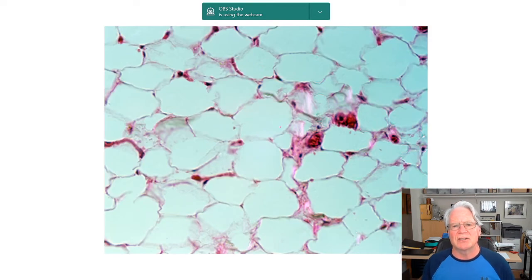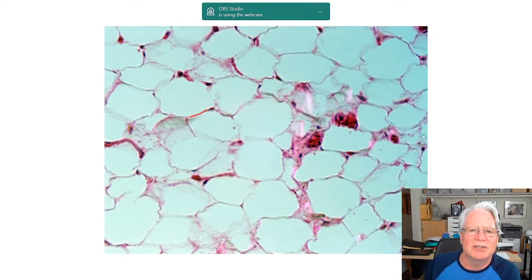Let's take a look at this again a little bit closer now. Same thing, we get these kind of flat surfaces here. This is a little bit irregular, but still fairly flat.